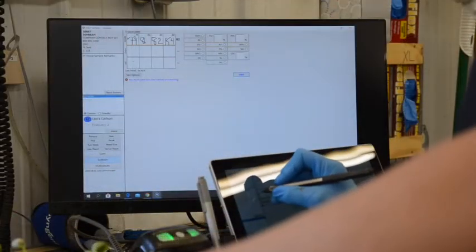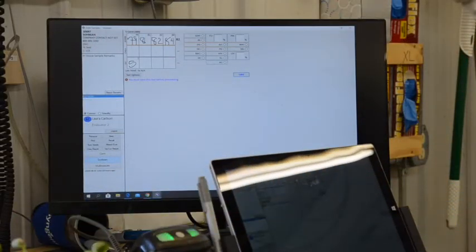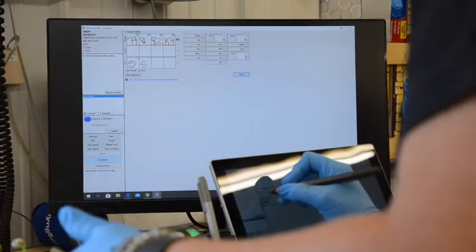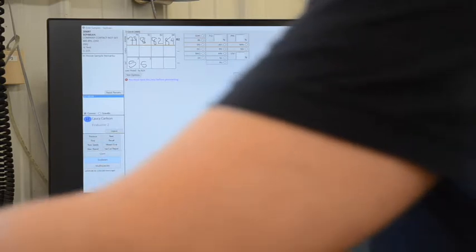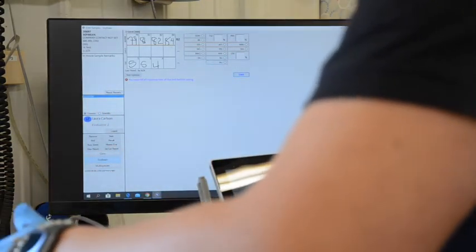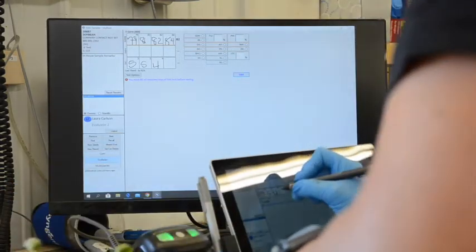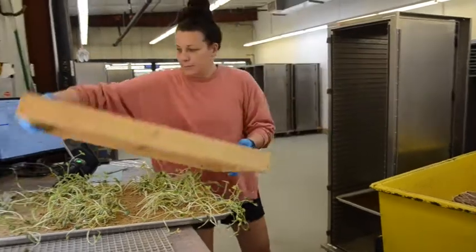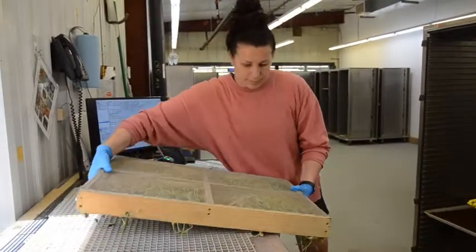We document everything directly onto the tablet and save it so the data goes out to the customers right away. We also have thresholds set up within our system — our in-house threshold is 90 percent and customers can identify what they want their threshold set up. If samples fall below the threshold, we can extend for up to two days.